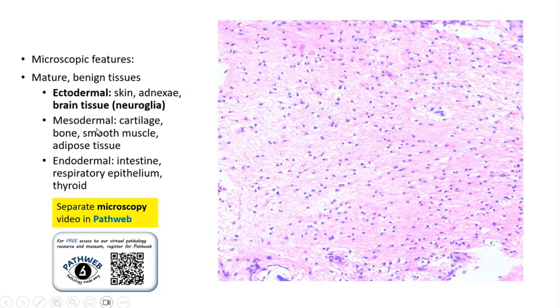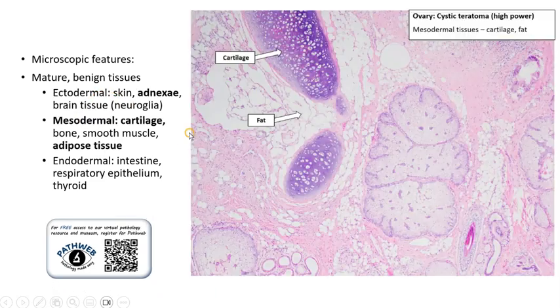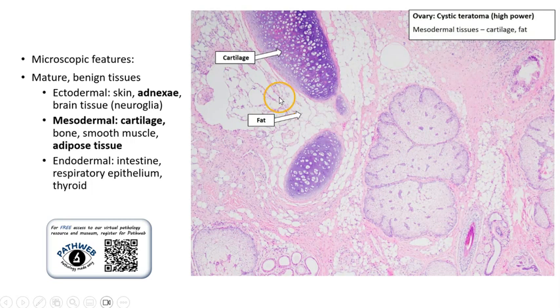It can also contain brain tissue. Very often, we can see neural glial tissue as part of the ectodermal layer. Here is an example showing mesodermal tissue, where we can see some islands of cartilage as well as some adipose tissue.